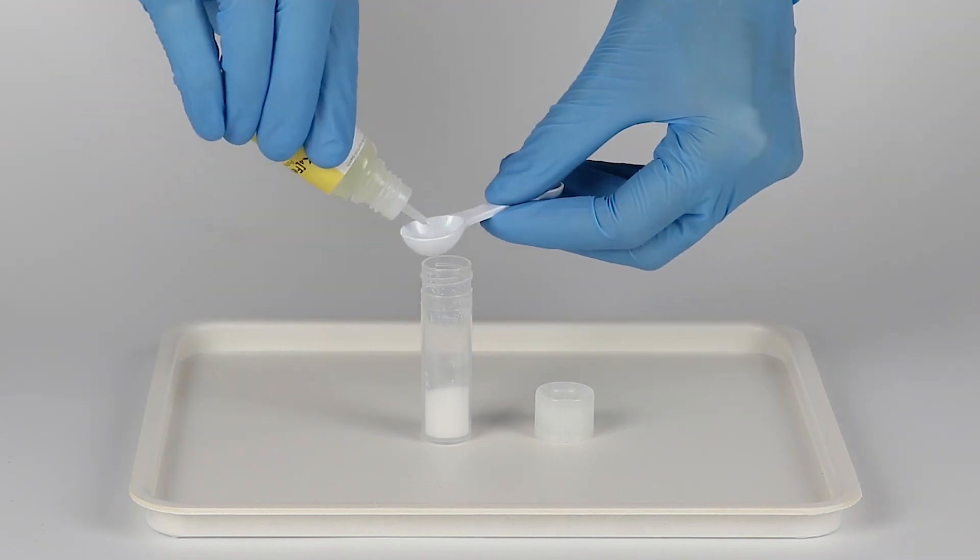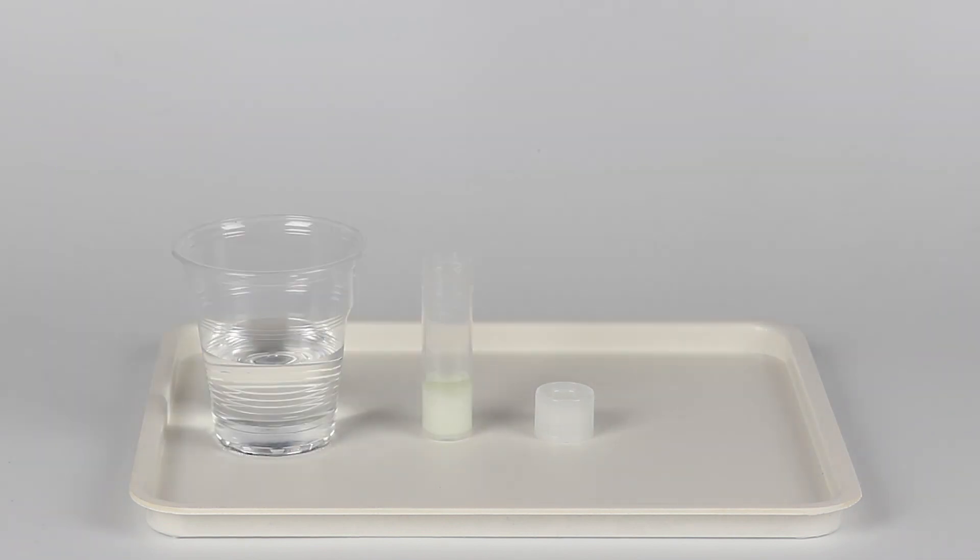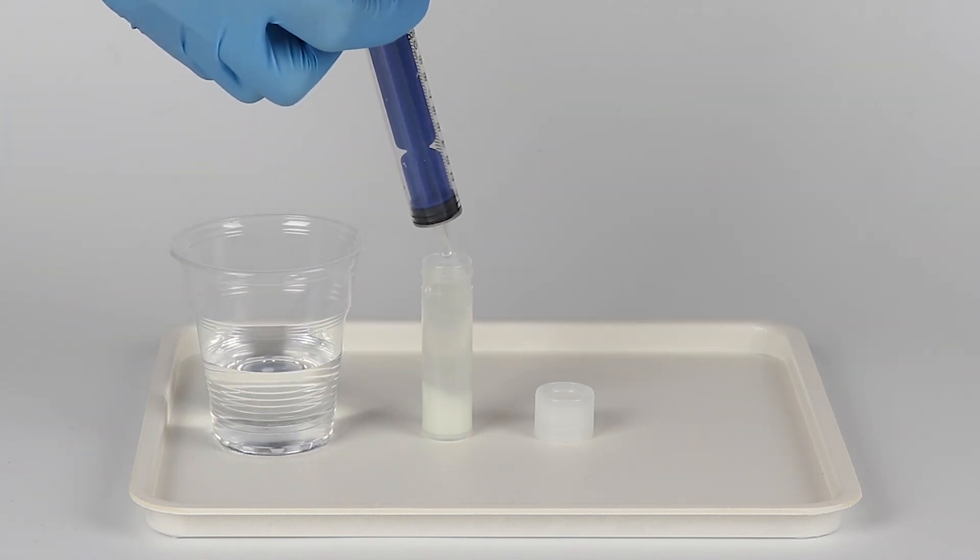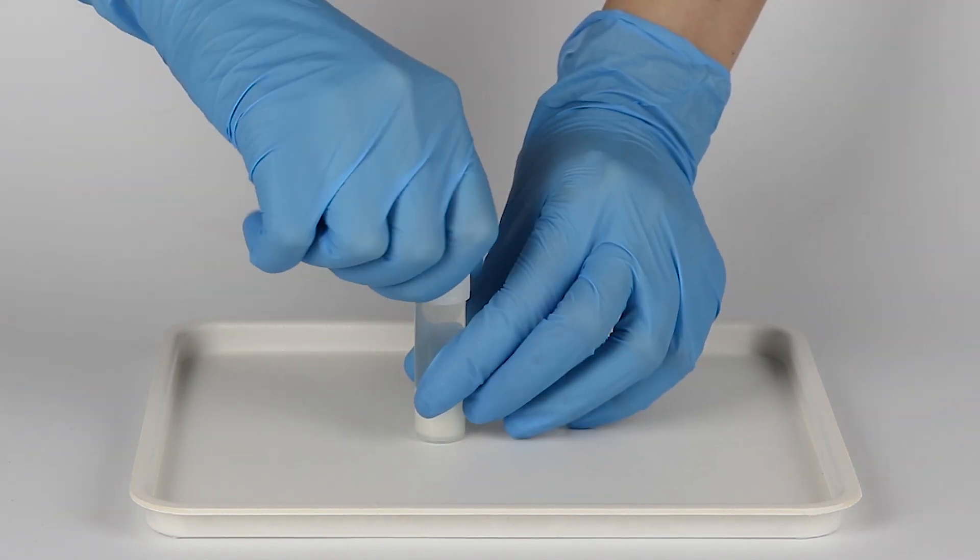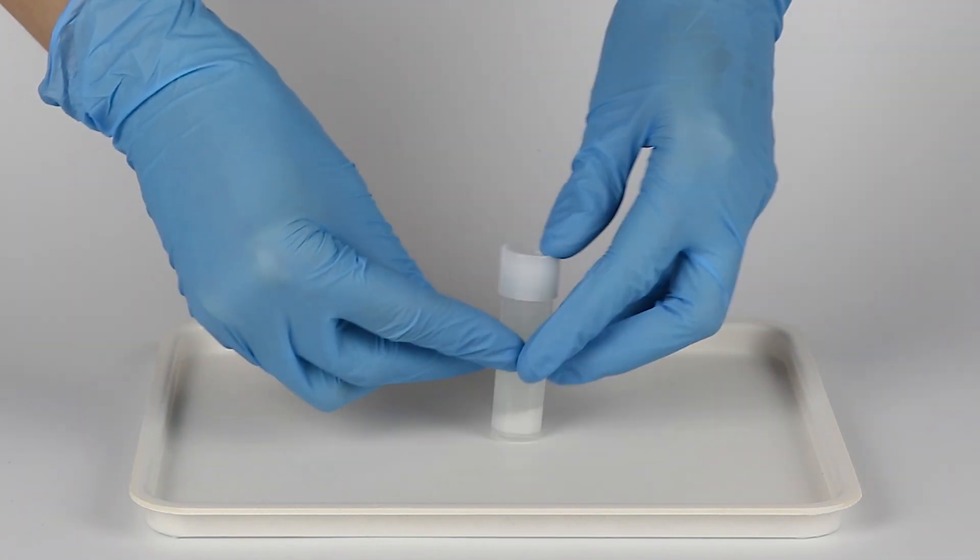Then add one big spoon of potassium ferrocyanide. Using the syringe, fill the vial the rest of the way with water. Close it with the cap and shake thoroughly to mix the contents. Put the vial into the holder.